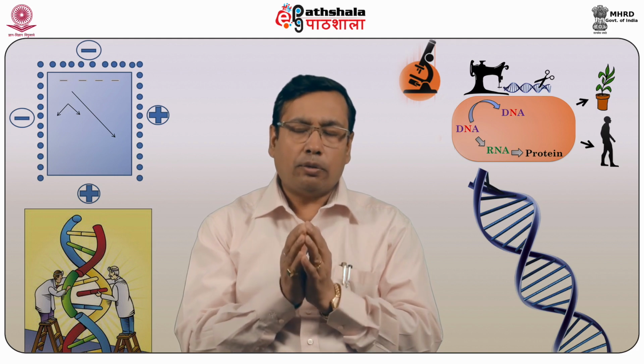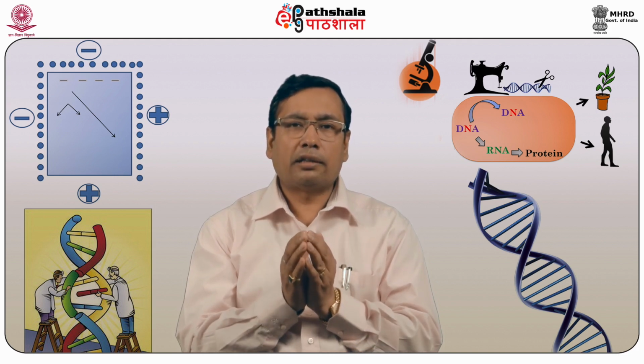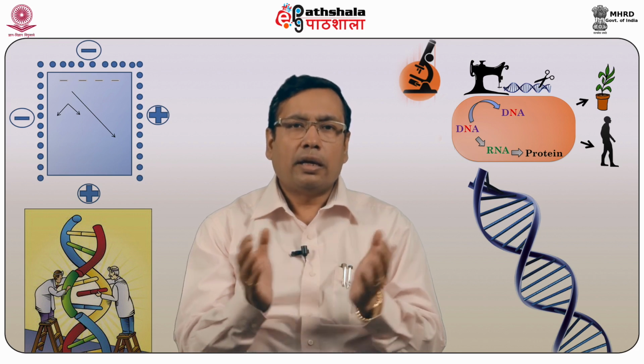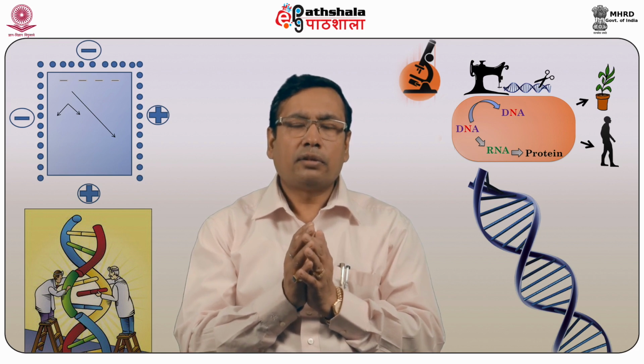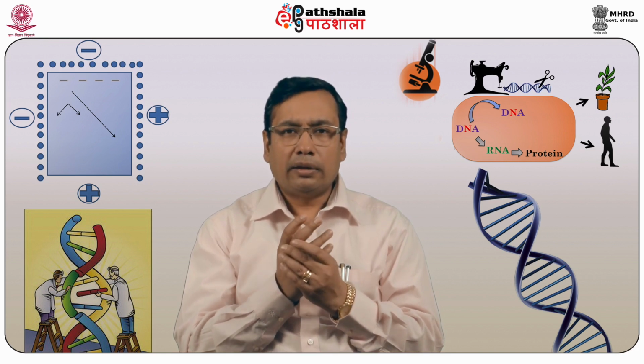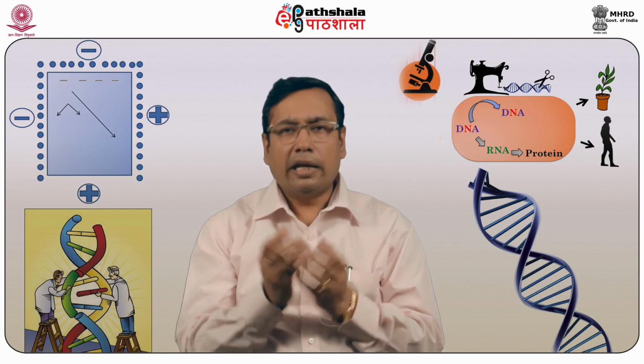This is an automated process, and with the help of a thermocycler, we amplify the DNA under different conditions, that is the denaturation condition, annealing condition and elongation.